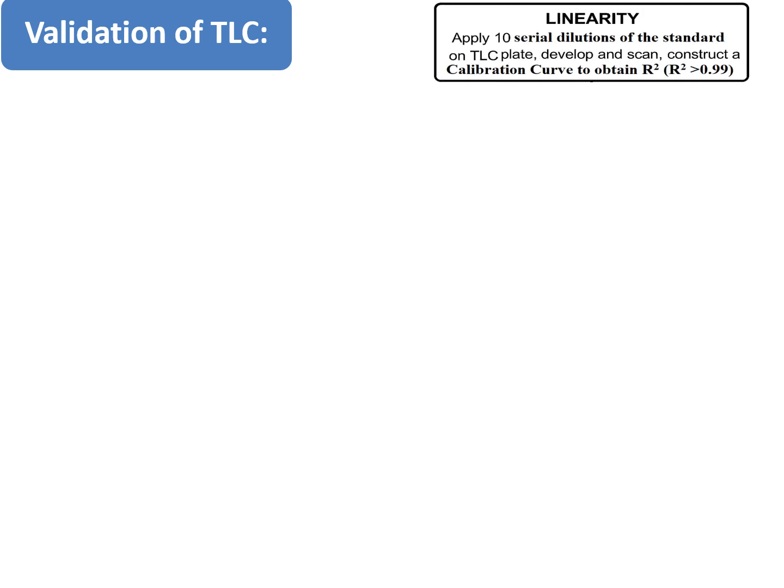During the validation process, several parameters are measured, such as linearity of the method, sensitivity of the method, specificity of the method, accuracy of the method, precision of the method, robustness, and so on. Now, let us look at the first parameter, which is linearity.